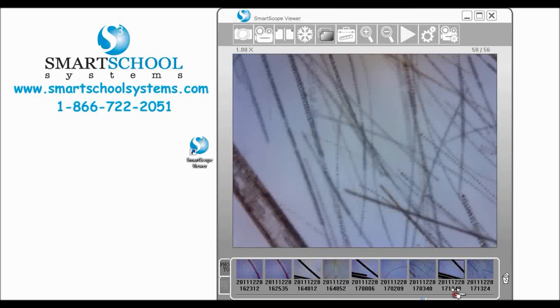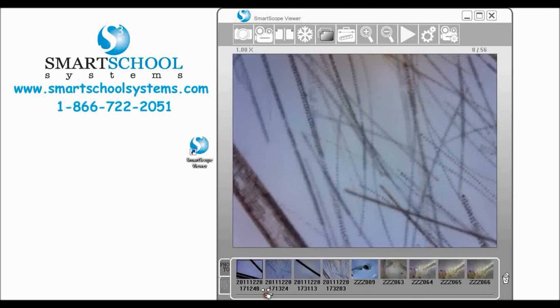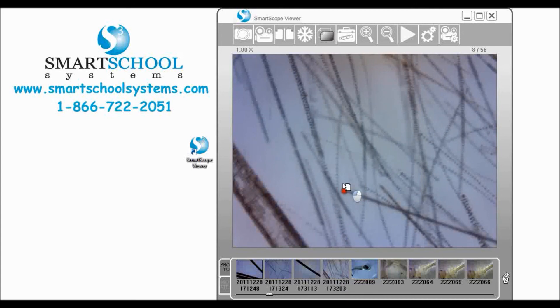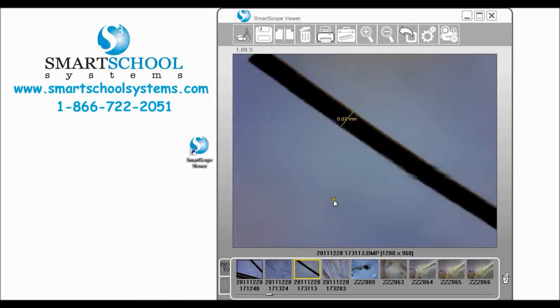Now the nice thing about our SmartScope is that once we've taken these images we can now come in and say okay let me view that image. There's our rabbit hair we just took and then here is our cow hair that we took earlier.